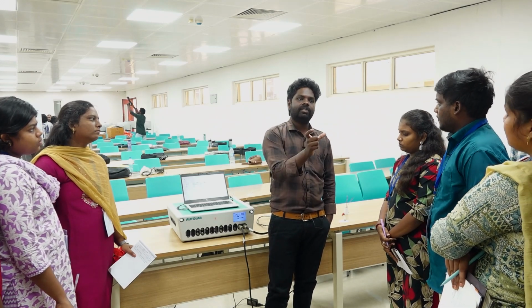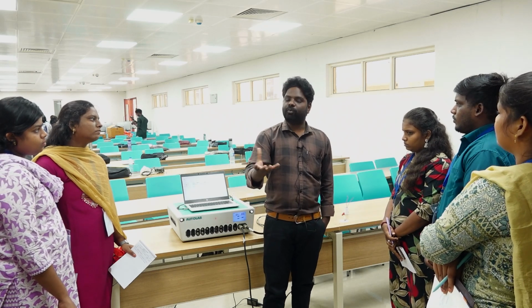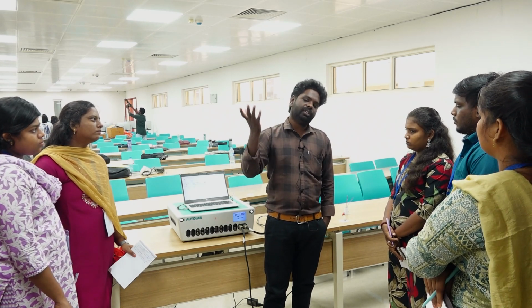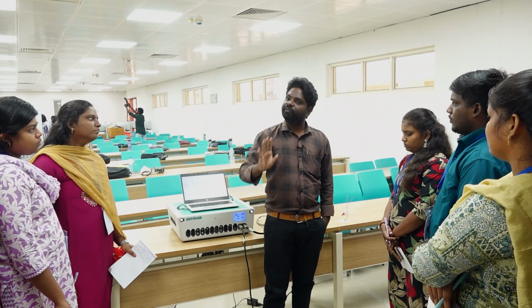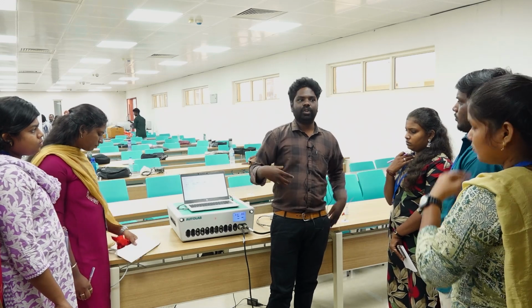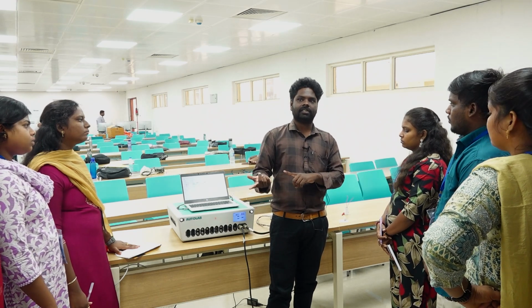Charge transfer resistance is this: if you are applying some input to your sample, either current, voltage or frequency, your material has some minimum resistance to oppose our input. Every material has resistance, and we are trying to disturb the material, so at least at some minimum level it tries to oppose our input. That is because every metal has its capacity. That resistance is charge transfer resistance.